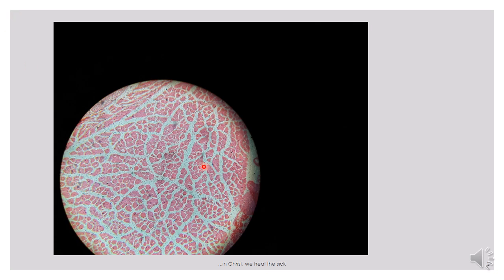Each fascicle is surrounded by collagenous tissue called perimysium. As we can see, what allows us to distinguish one fascicle from another is that there is a thicker space surrounding the fascicle. We can map out this as one fascicle, and this as another fascicle, because of this wider space. This space bounding the fascicle is called the perimysium — it is also a supporting collagenous tissue, but much bigger than what we see in the endomysium.